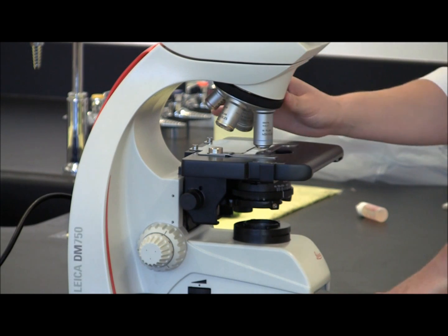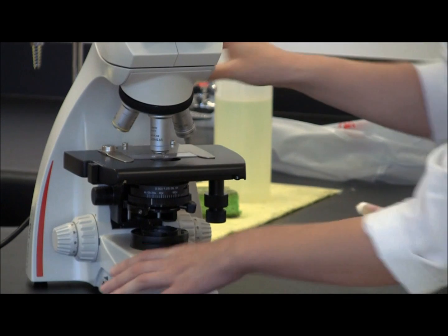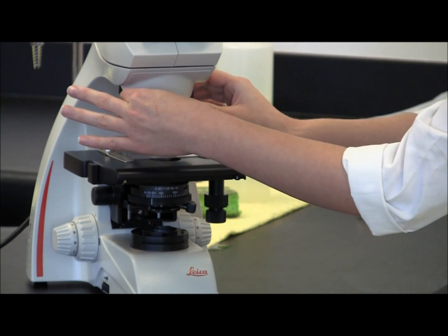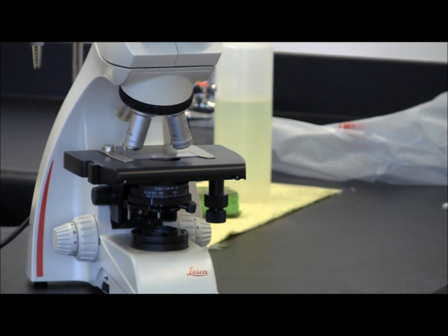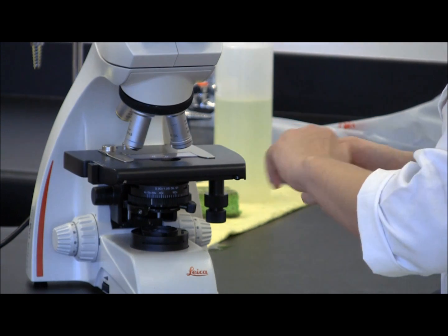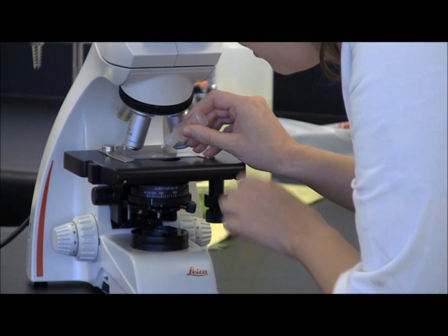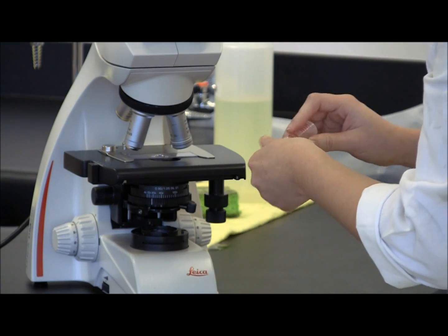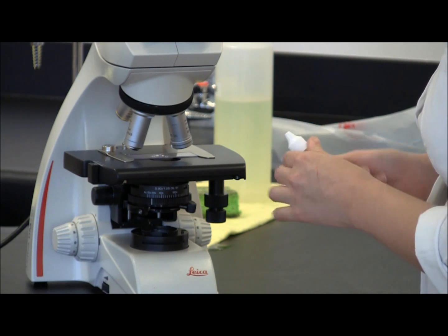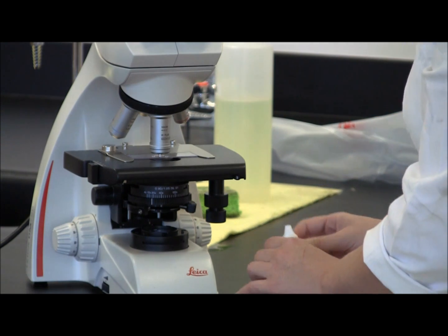Once you've done that, we're ready to move to 100x oil immersion. To do this, you want to turn the objectives so that you're in between the 40x and the 100x. Oil immersion is located in your drawer. You only need 1 drop of oil, and you do not need more than a drop. So just place that on the center of your slide, and then gently drag the 100x objective into the oil.